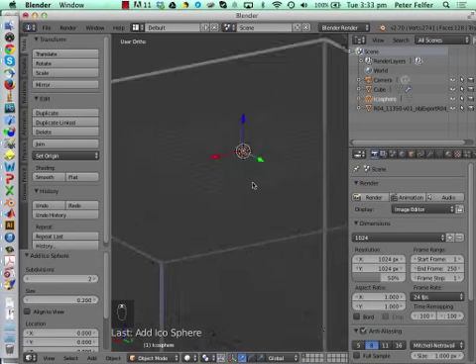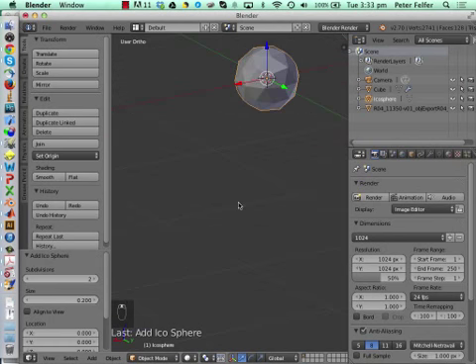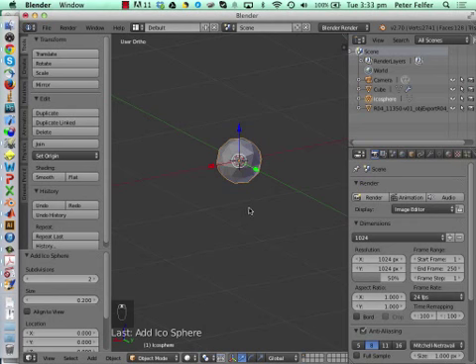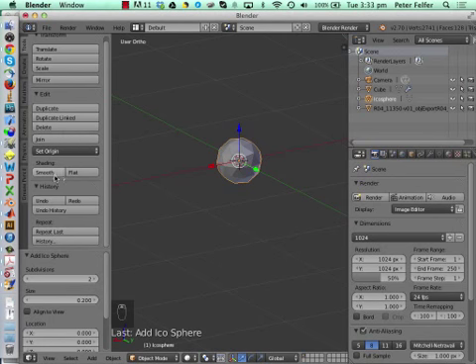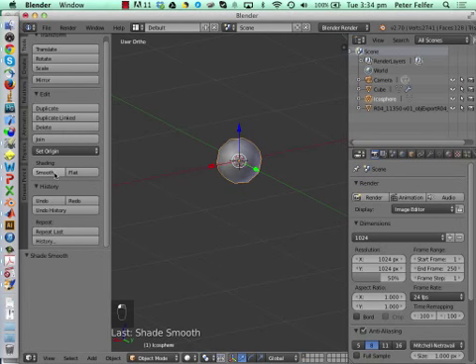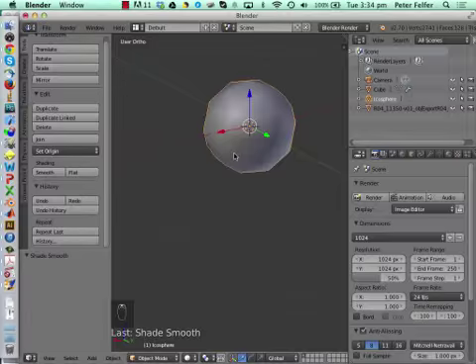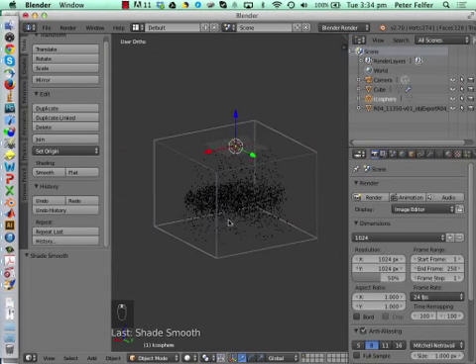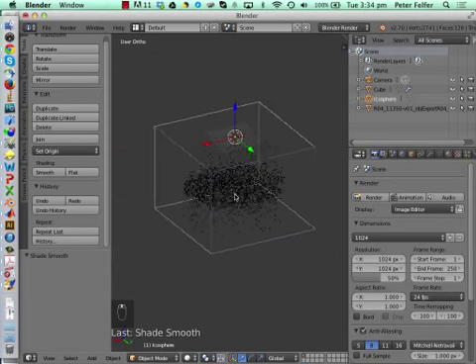Of course, that's pretty small now, but you can see the sphere. We've got a small icosphere here, with flat shading. We want the shading to be interpolated. So if you click smooth, you can see it looks more sphere-like. If you go flat, it looks like the actual polygons. Anyway, this is the basis for a visualization.